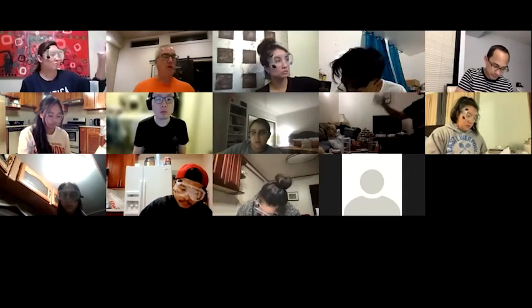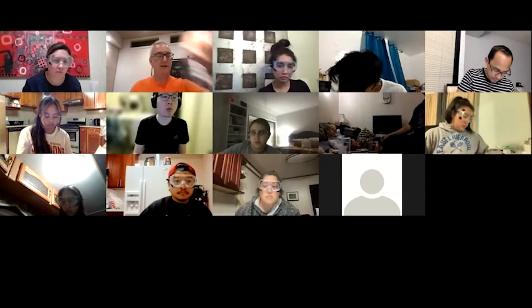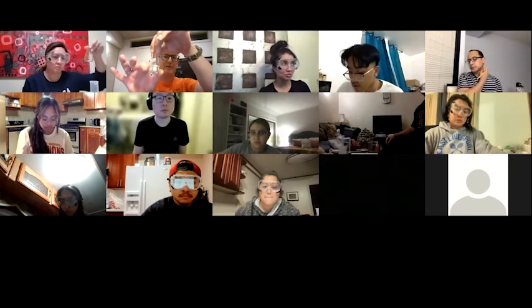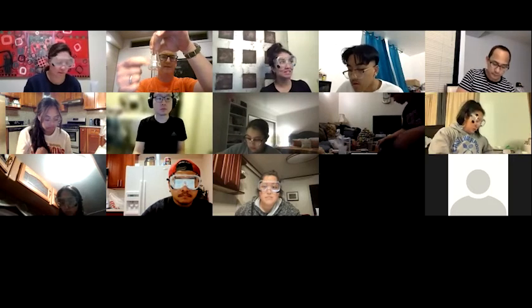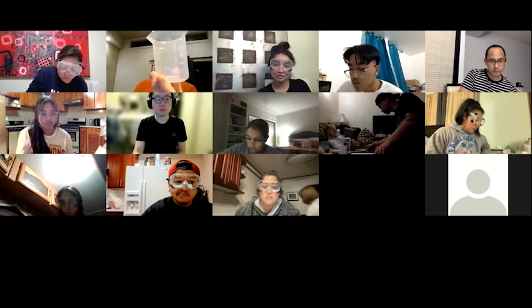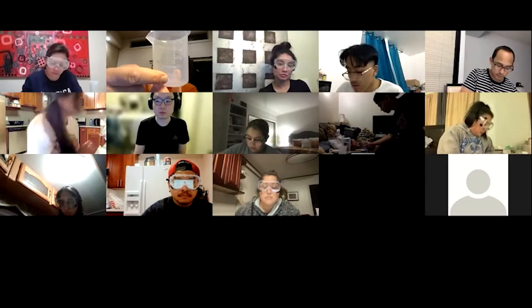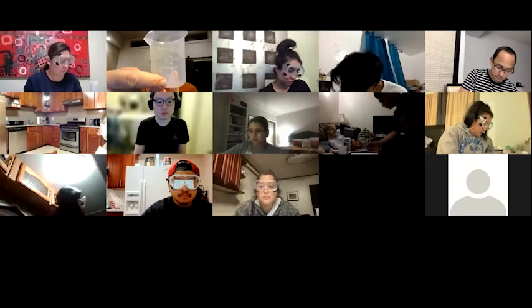But you have an advantage with this that you wouldn't have with this, because this is a conical shape, which makes trying to figure out what the interval is difficult. This is the same shape all the way up and down. So you know that these intervals are 10 mils. So you can do a fairly good job estimating where 35 is going to be.